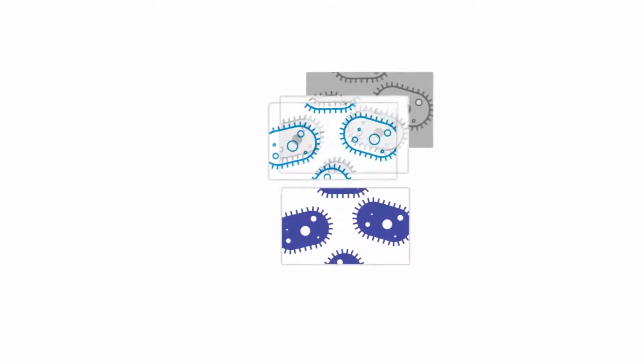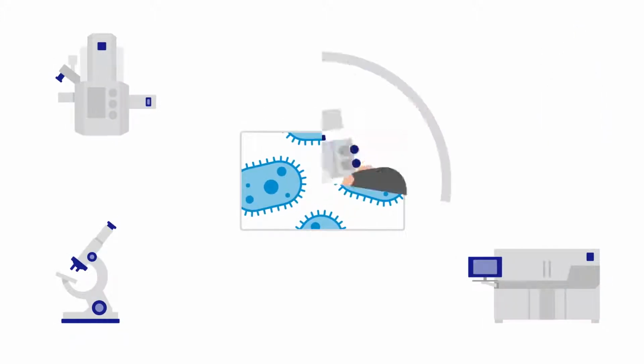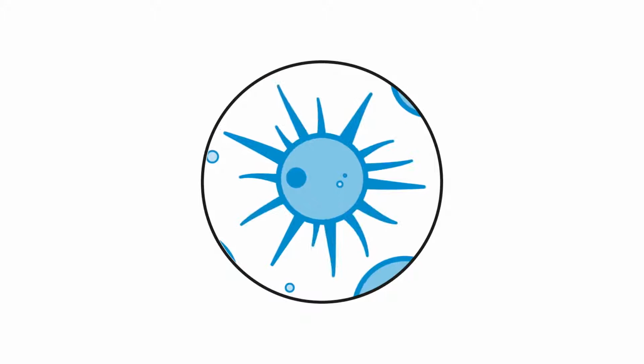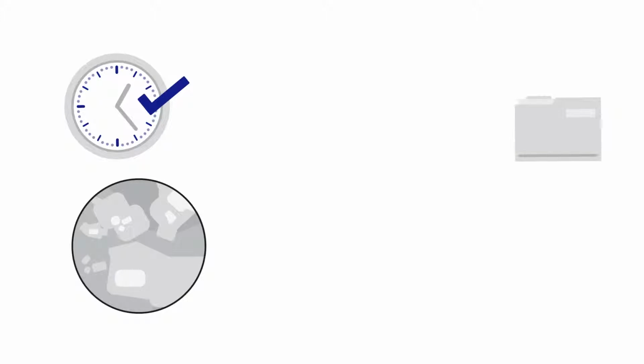And then comes the task of overlaying images, also quite difficult when you're using several devices. All of this takes lots of effort. Whether you're analyzing a living cell to detect cancer behavior or performing defects research on a metal gear wheel, it is correlative microscopy that delivers unique insights into your sample and lets you acquire relevant data in less time.